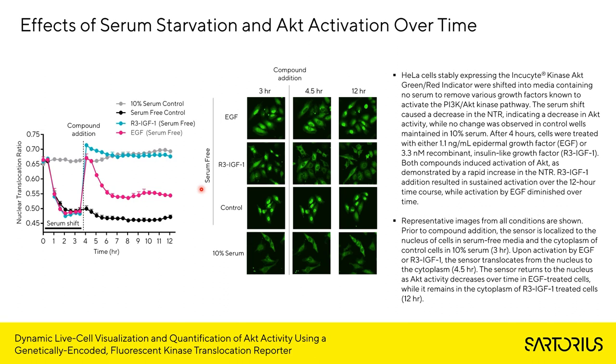R3-IGF-1 addition resulted in sustained activation over the 12-hour time course, while activation by EGF diminished over time. So this was a transient induction of AKT caused by EGF, as opposed to the sustained activation of AKT caused by R3-IGF-1. Representative images from all conditions are shown.